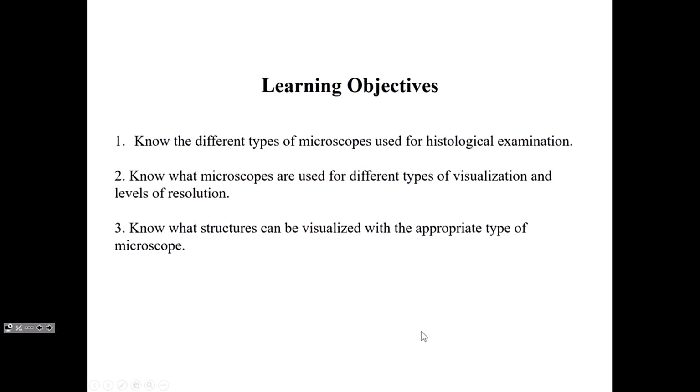Okay, having said all of that, the first lecture then is histologic techniques. So how do we look at tissues and organs in the body? Because basically we're going to survey the entire body, every tissue, every organ of the entire body. By the time you're finished with this histology, because you will know so much about your own body and how it works, I think you'll be very pleased with your amount of knowledge from this particular course.